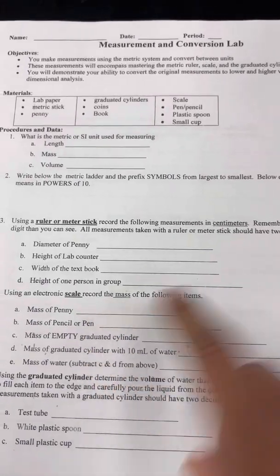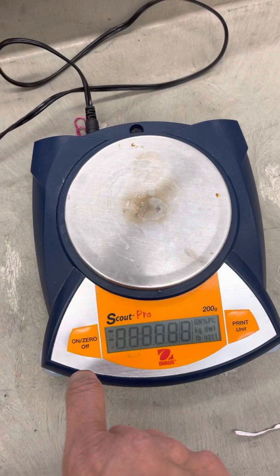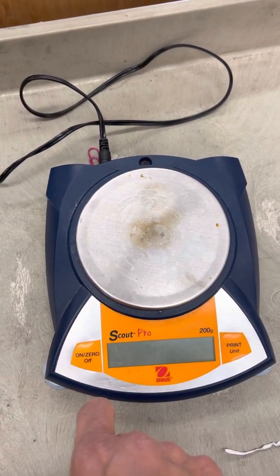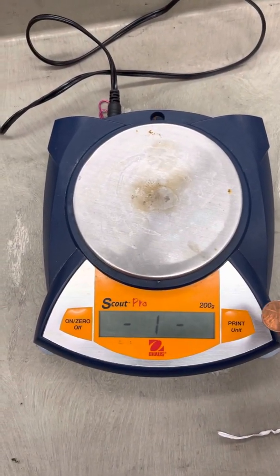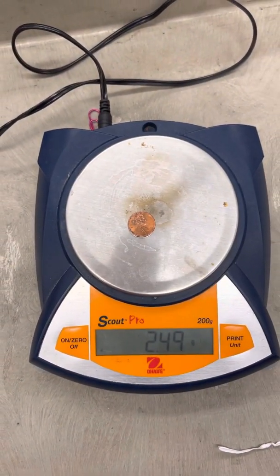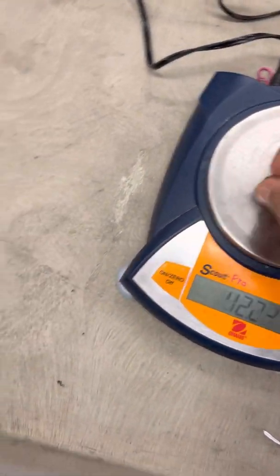So, mass of a penny. Here we have our penny. We're going to bring it over to the scale, turn it on, and wait for a second. Okay, there's the mass of a penny, 2.419 grams. It's all in grams. Okay, the next one.